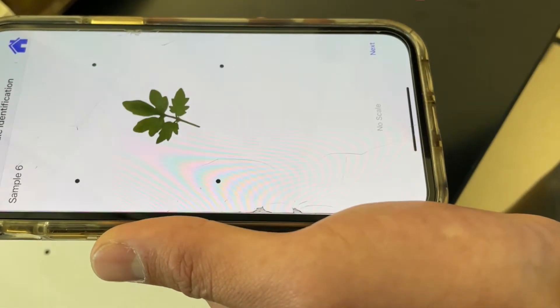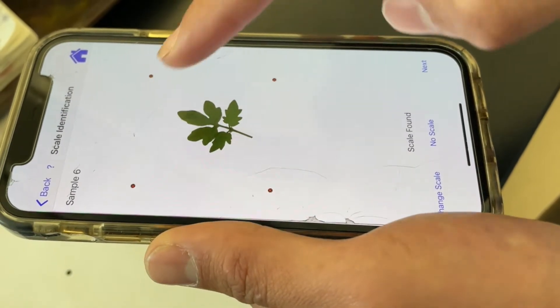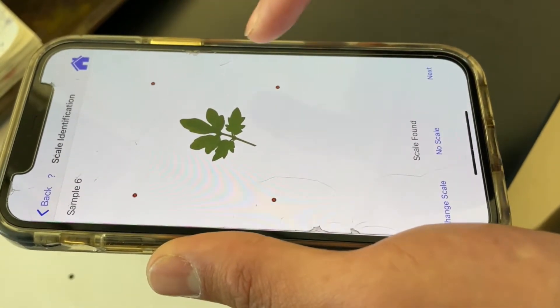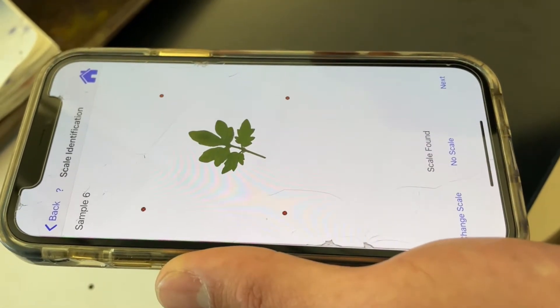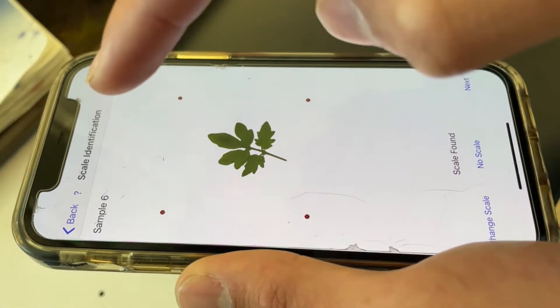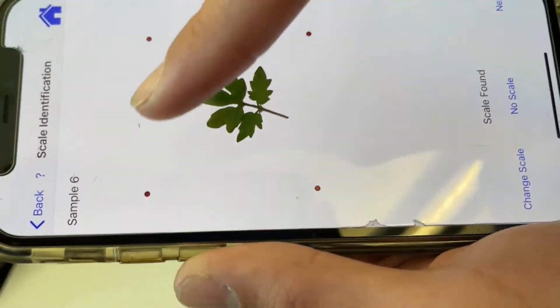After that you're going to do next. Once you have that, it's going to look for a scale and that's going to be these four dots. So if there's a red X on each of those dots, that means it's found your scale. If it doesn't have that, you need to just press on each of them until they have that small red X on there.